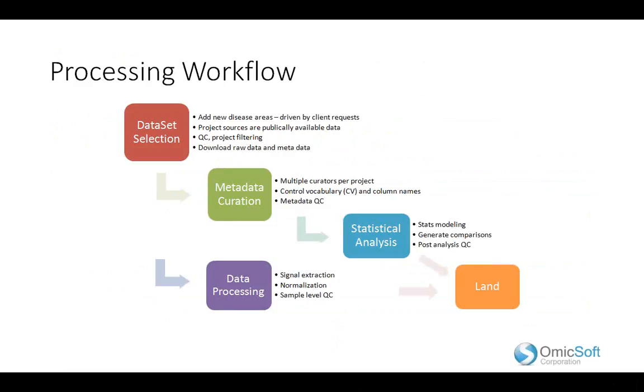Then we have post-analysis QC. You always want to check your analysis. After these analysis and validation steps, these comparison results we are going to land, and also if you already normalized the raw intensity values, the normalized intensity values will also go to land, as well as the metadata.